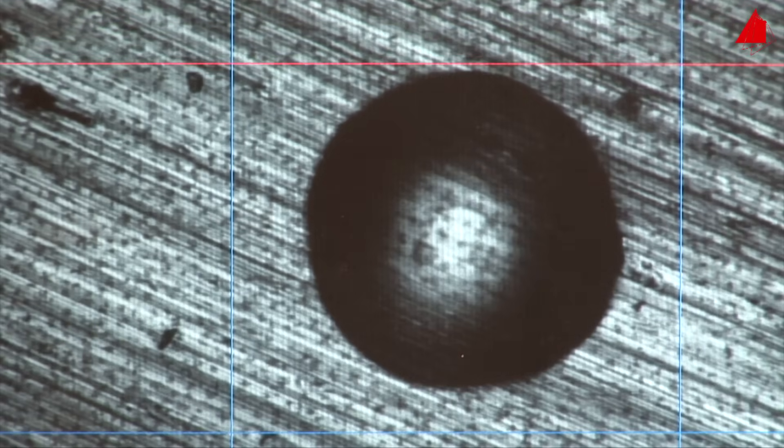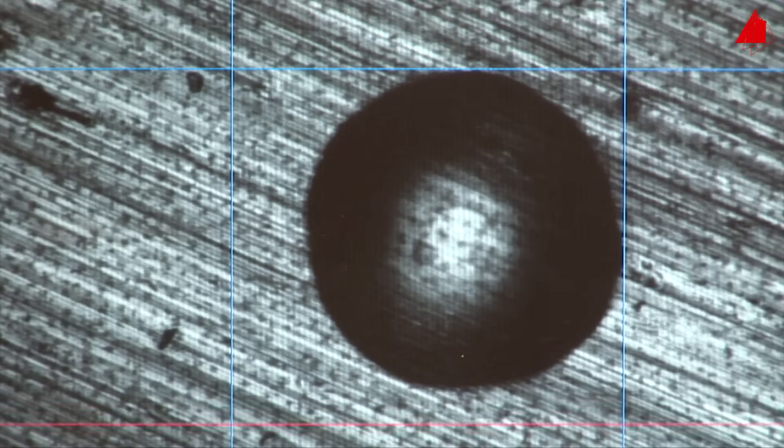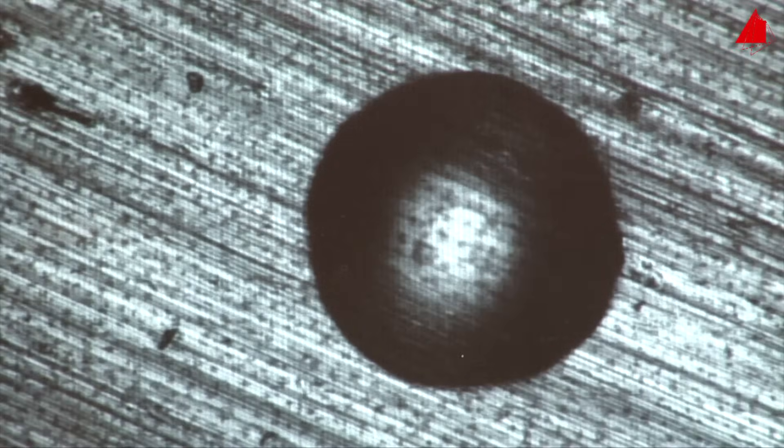With the control knob, the tester places four measuring lines on the edges of the indentation to measure its diameter. That's it! The testing machine can now calculate the Brinell hardness.